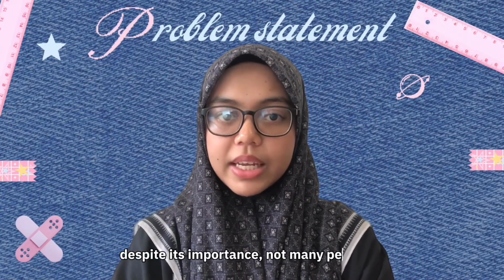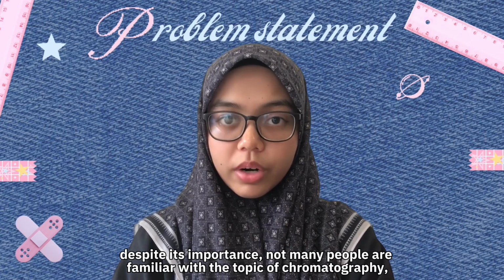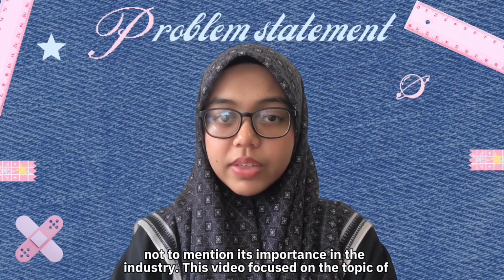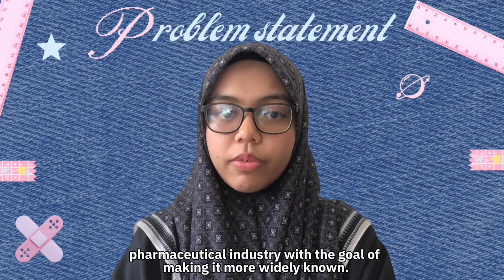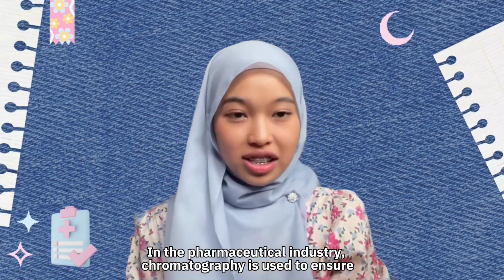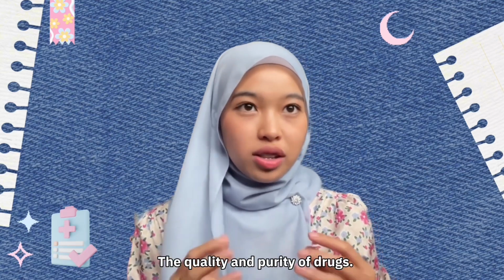However, despite its importance, not many people are familiar with the topic of chromatography, not to mention its importance in the industry. This video focuses on the topic of chromatography and the importance of chromatography, especially in the pharmaceutical industry, with the goal of making it more widely known. In the pharmaceutical industry, chromatography is used to ensure the quality and purity of drugs.